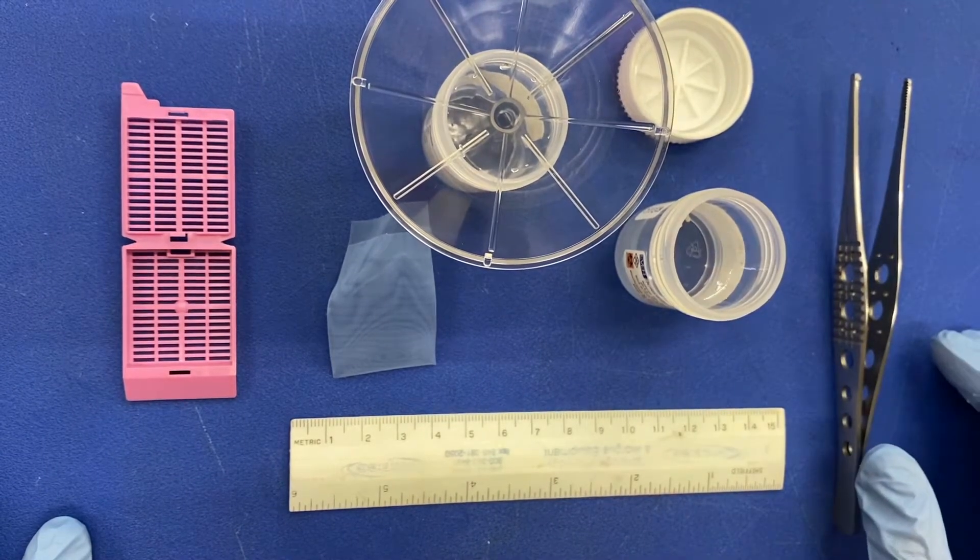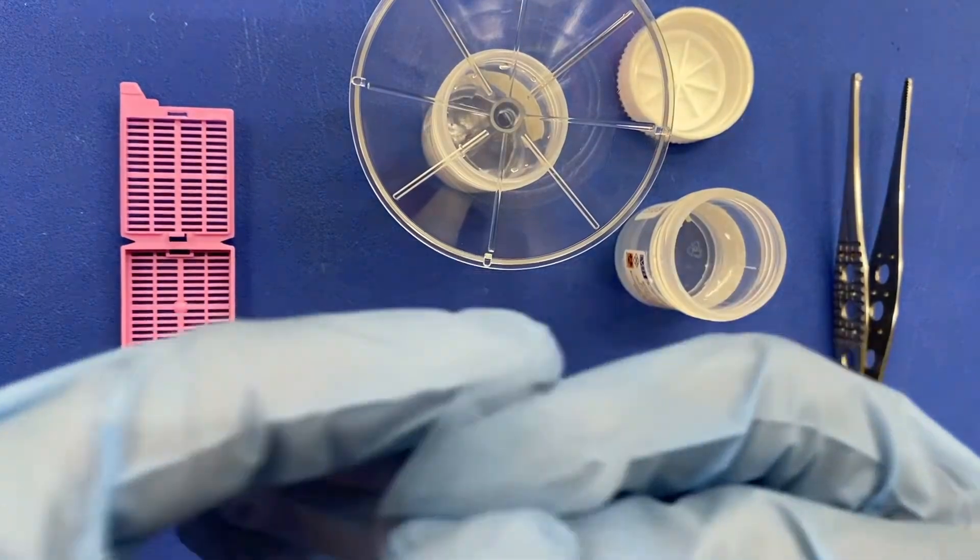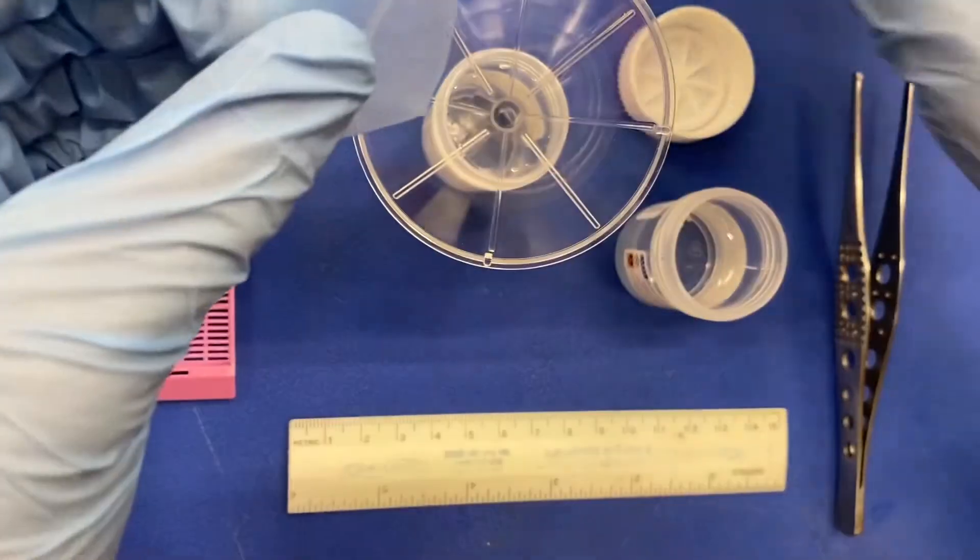Once you locate the specimen, set the container down and get your biopsy bag, your funnel, and your empty container ready.